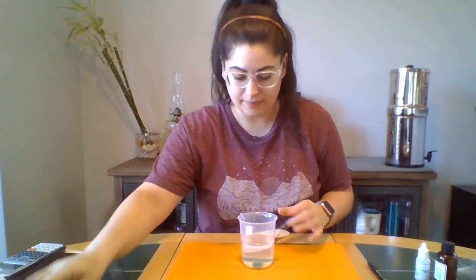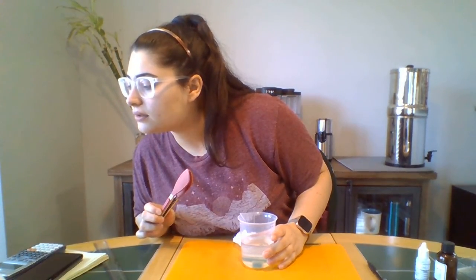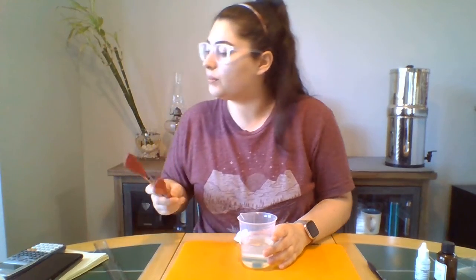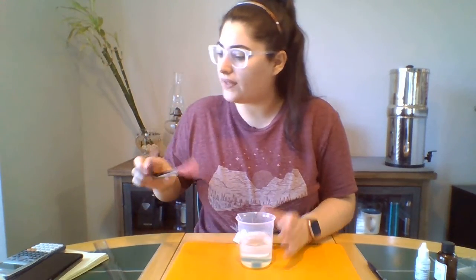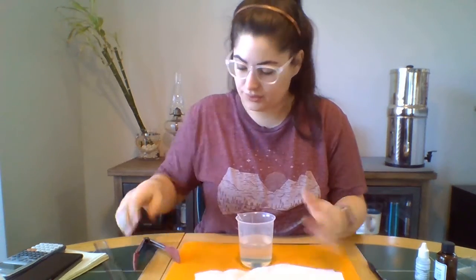So, guess we'll get these out. Does it say take them out? Let the blocks rest in vinegar. After 7 minutes, remove the blocks. Pour the remaining vinegar solution. Okay. And then gently blot the blocks dry. Okay, so I guess I'll use this.